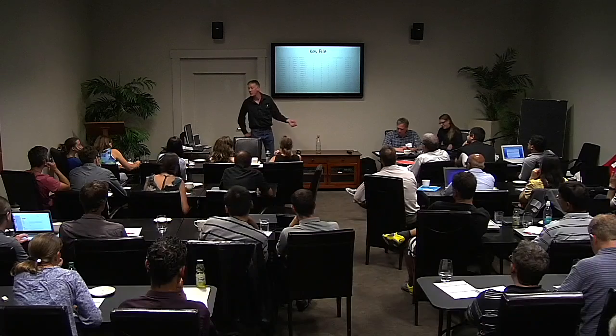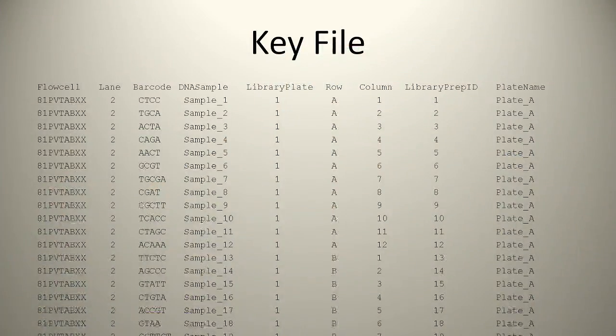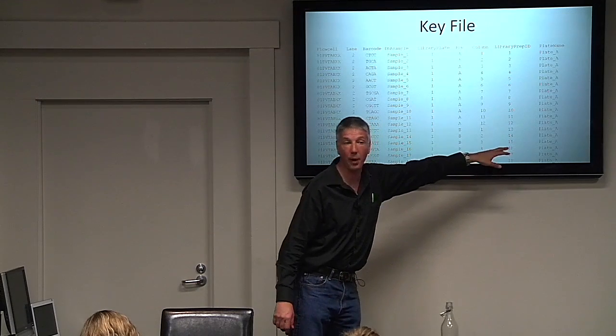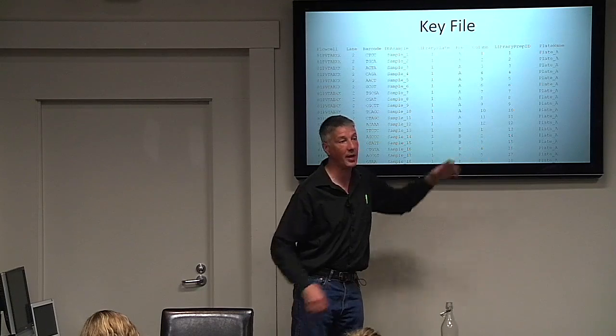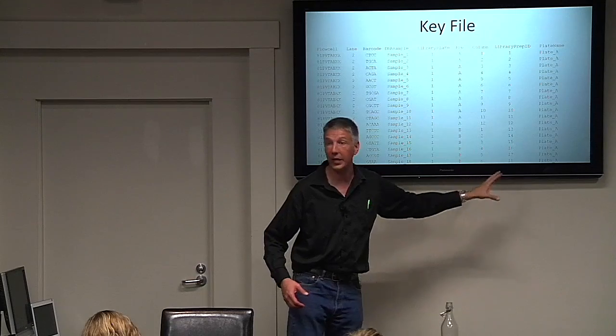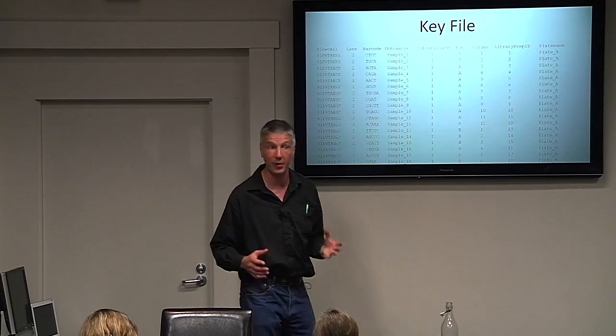There are ways to do this in the pipeline. Yeah, so there are tools available to do this merging of things, and it can be done at the level of sample name, but there's also this column of library prep ID. You know how we said before that sometimes you'll take a library and you'll run it multiple times, right? Okay, so if it's coming from the same tube, the same library, and it's the same sample, it will always have the same library prep ID. And at Cornell, we developed a system that as it goes through the process, it generates that unique identifier and keeps it in a database. And this is something as a community, as we start building up our own infrastructure, we'll have to sort out how best to do that together.